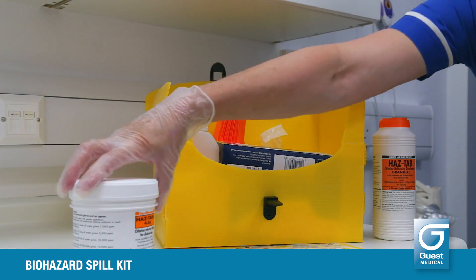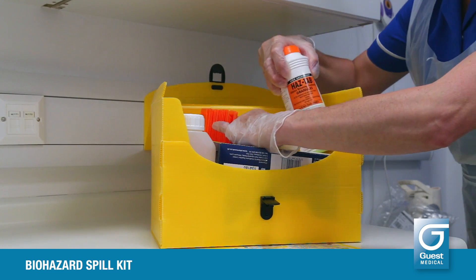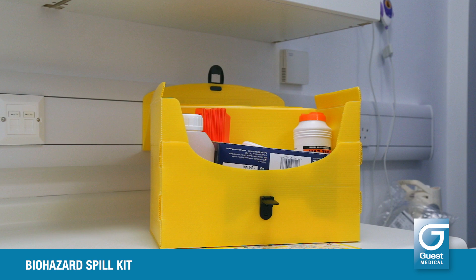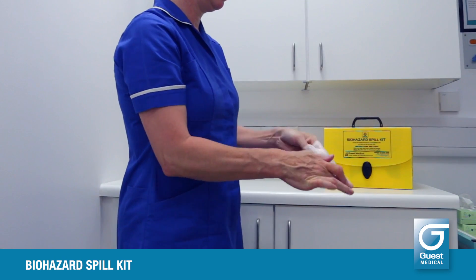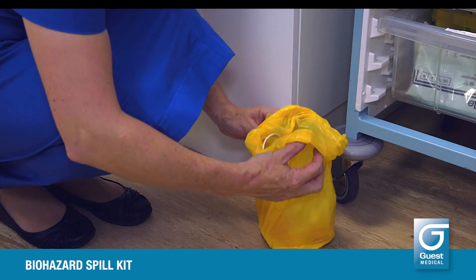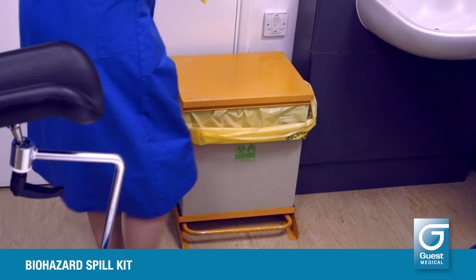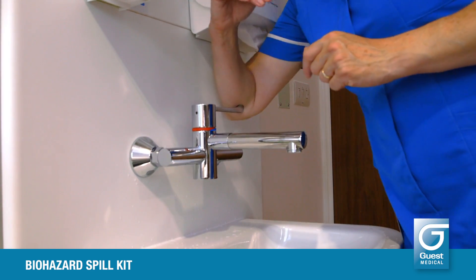Put the diluter back in the kit box. Check to see if any of the kit elements need replacing before you close it and put it away. Gloves, aprons, paper towels and waste bags may be replenished from ward stocks. HazTab tablets, HazTab granules, scoops and scrapers, and if necessary the diluter, may be ordered from your stores or supply chain. Remove your PPE — gloves last of all — and discard them into the waste bag. Only touching the outside of the bag, tie it into a knot and discard the whole thing into your clinical waste system. Now wash your hands and dry them carefully.